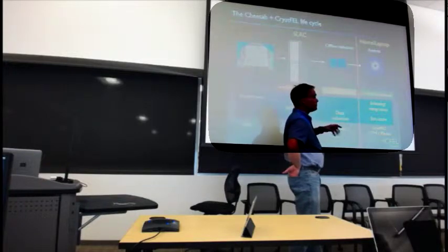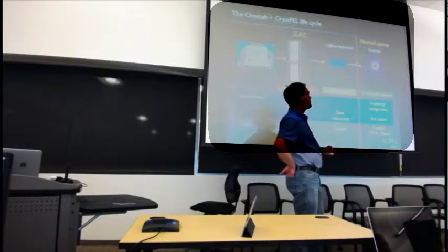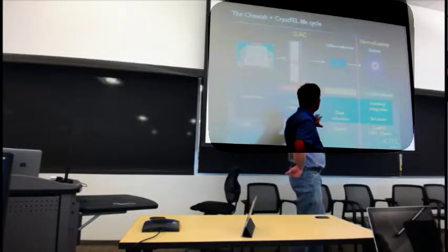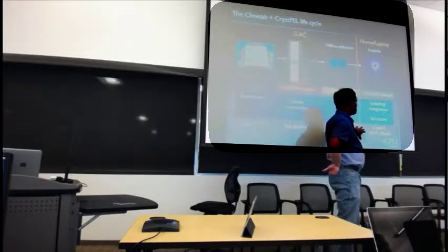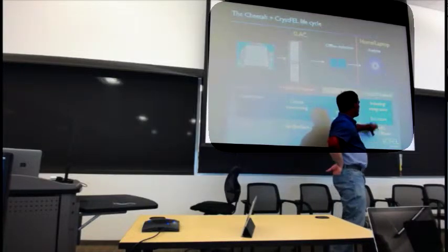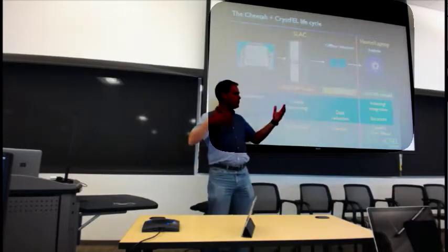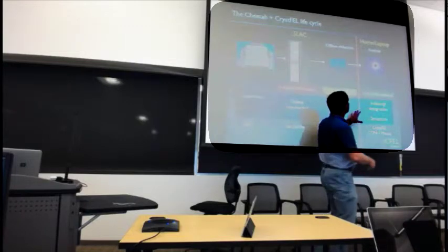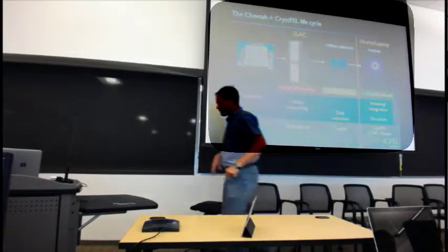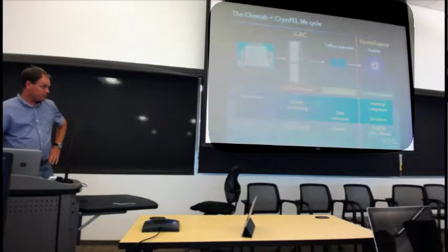For example, with the Boot A data, just a couple of clicks and the data comes back from the tape system and magically appears. We do all of this data reduction at SLAC, generate the reduced data set, ship that home, and then this all operates outside of the framework, giving us a little bit more flexibility, with no need to use virtual boxes and so on for the indexing and integration step. That's just a slightly different philosophy that we adopted, and it all operates there.